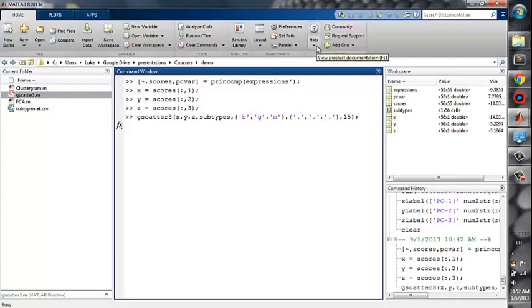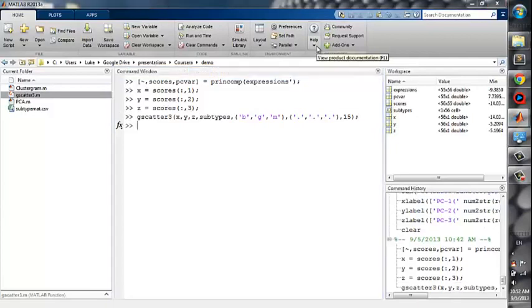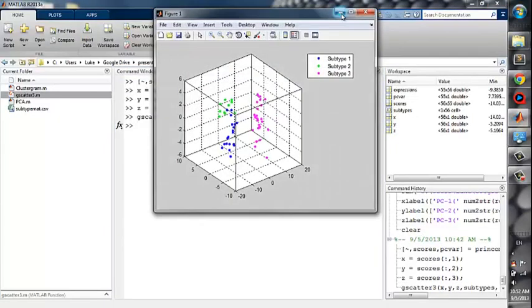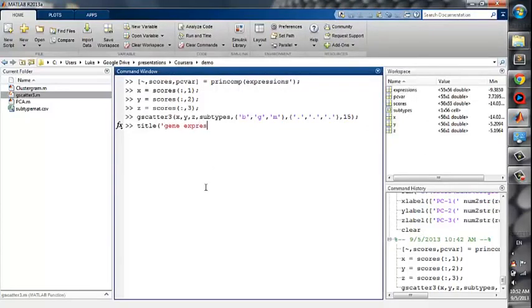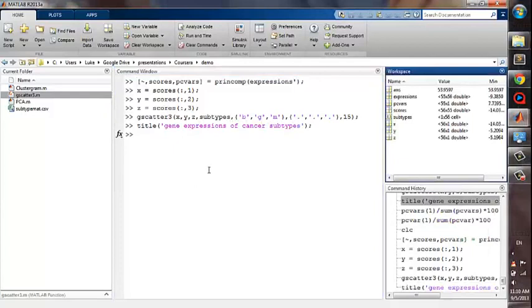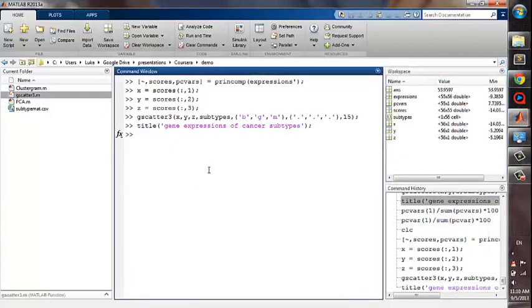We got our figure. The next step is to put some annotations. Use title function to add a title to the figure. Just put the name of the title as a string in the function. Here I will give the name as Gene Expressions of Cancer Subtypes. Now, let's look at the figure. You can see it has a title.